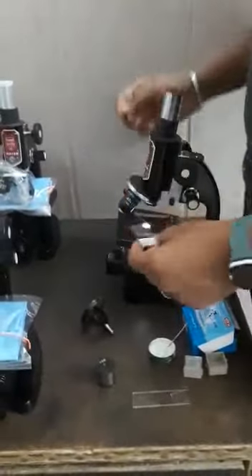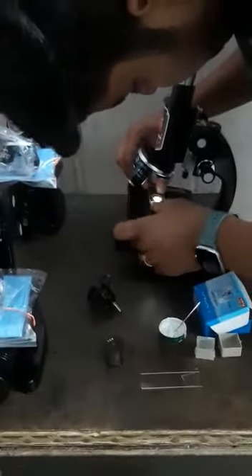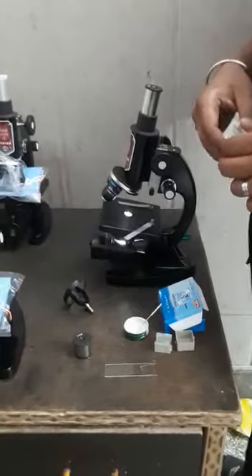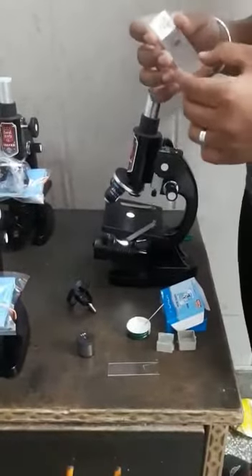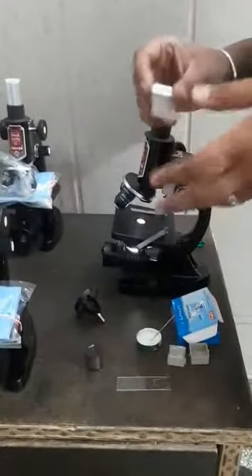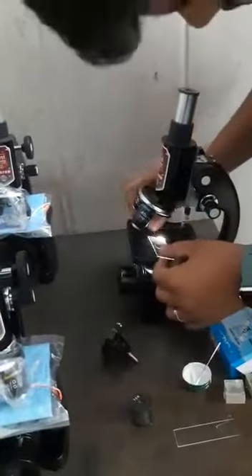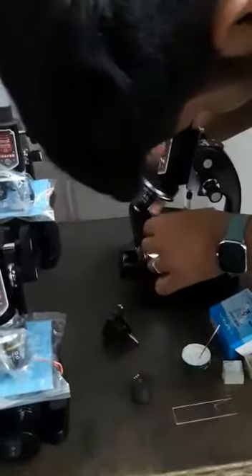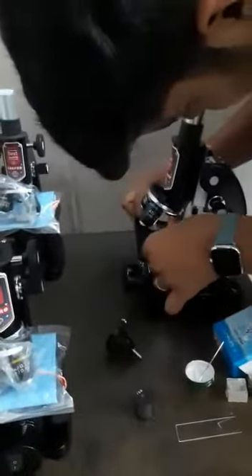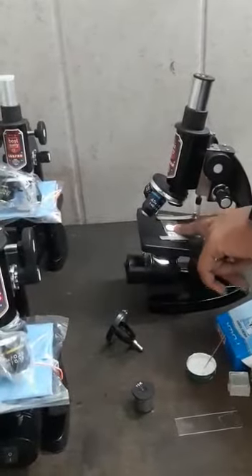I will place the slide here. You have to take care that the upper side of the specimen should be placed facing up in the microscope — only then will you be able to see results; otherwise you won't see anything. Please also take care that the specimen should be in the lighting area of the microscope.